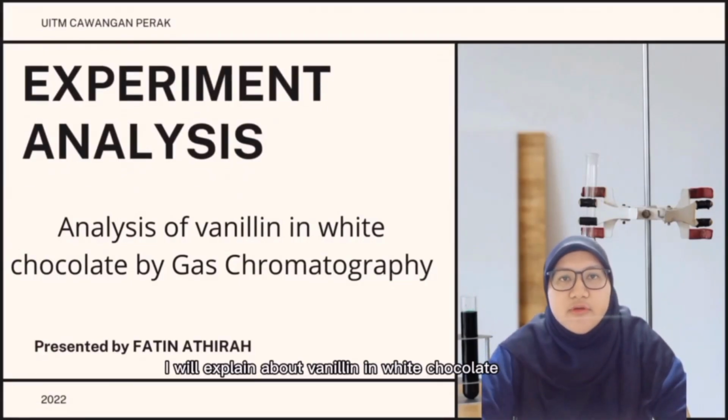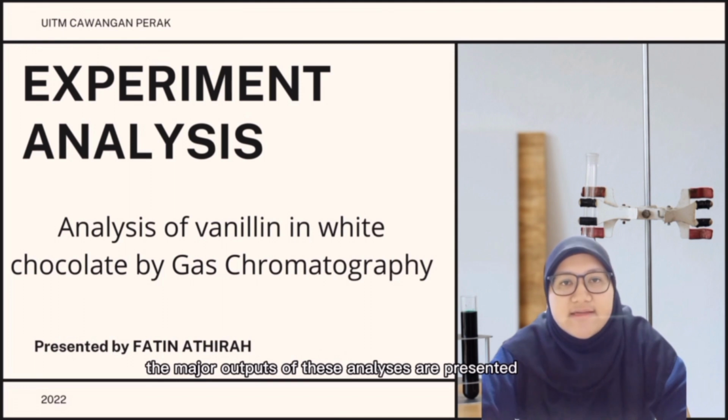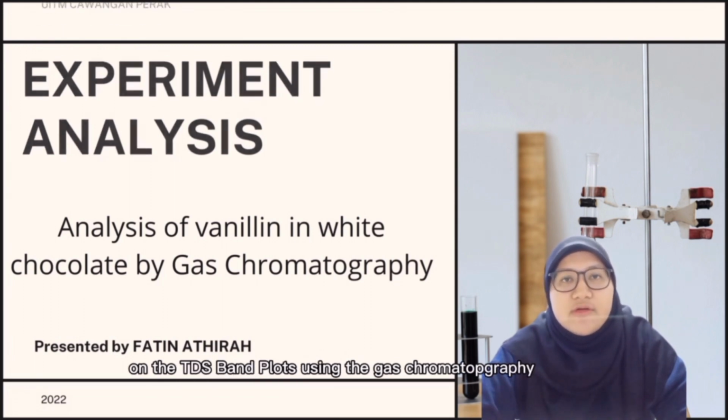In this analysis, I will explain about vanillin in white chocolate by gas chromatography. For quantitative analysis, 3 countries were chosen for the origin of vanilla to find vanillin characteristics in white chocolate, which are Madagascar, Indonesia, and Papua New Guinea. For the qualitative analysis, the temporal dominance of sensation was tested on white chocolate with 3 vanillas. The major outputs of this analysis are presented on the TDS band plots using the gas chromatography.